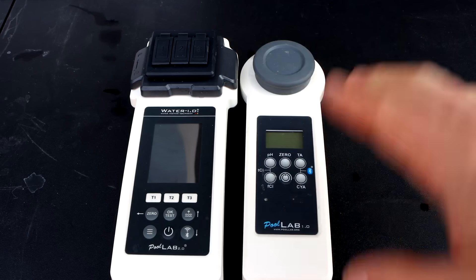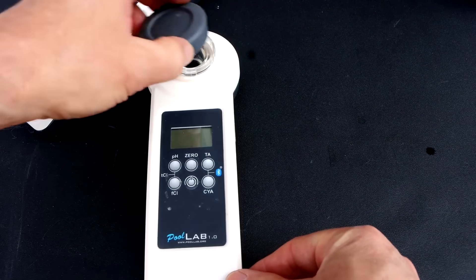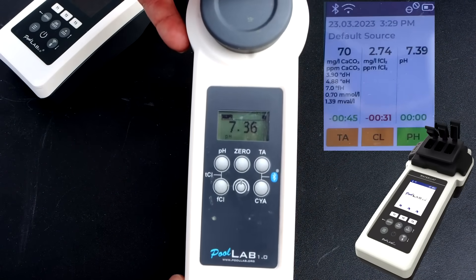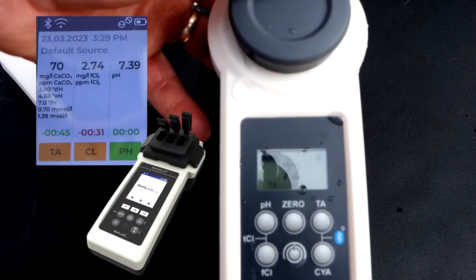I've been using the Pool Lab 1.0 for many years and I'm really glad they came out with the 2.0 — there are a lot of advanced features over the 1.0. For comparison, I'm using the same water sample in the Pool Lab 1.0. The pH is coming in at 7.36 and the total alkalinity is coming in at 72.